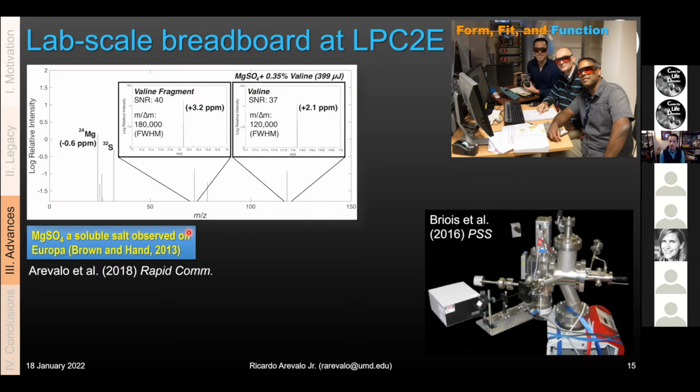So here is a spectrum we collected on that French prototype instrument where we can see the molecular ion. We can see a characteristic fragment. It's the same fragment that, if you go to the NIST WebBook, would be what you would expect to be the dominant fragment if you were also analyzing this with a 70 eV electron ionization source. And then, fun fact, we can see the inorganic information. And if you're familiar with the periodic table, you'll also see the diagnostic isotope abundances of magnesium. Sulfur is a little bit harder to see, but now you're starting to see the range of information.